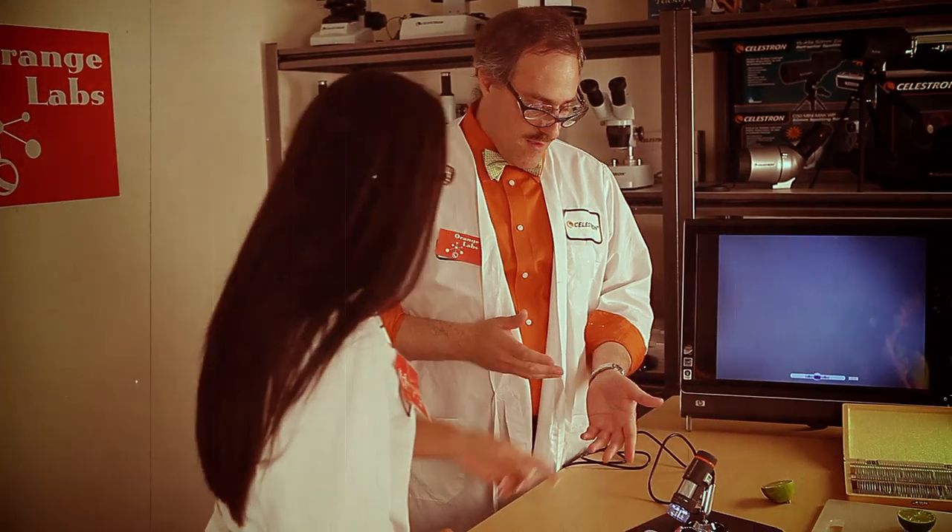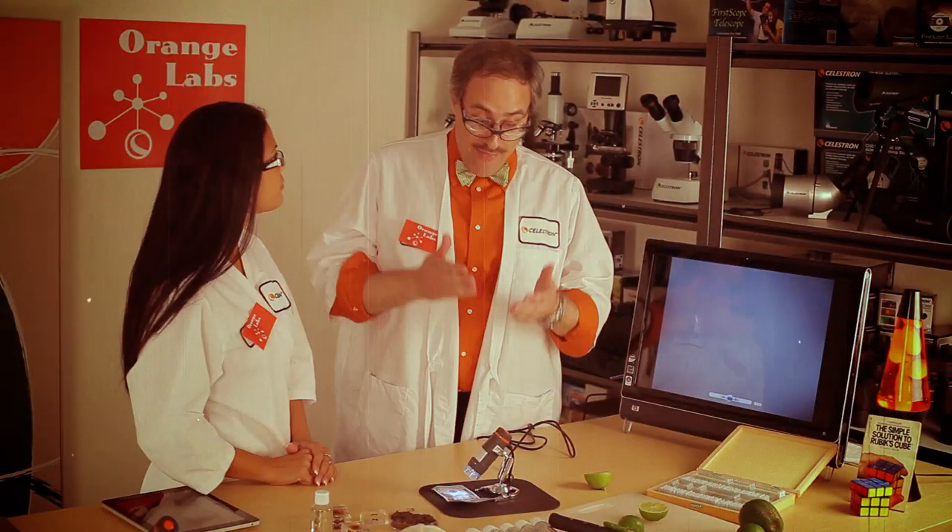So let's go through the features again: it's got 10, 40, and 150 magnification; a built-in LED to illuminate your samples; photo management software; it takes 1.3 megapixel pictures and video; and it plugs right into your computer using a USB port, which means it doesn't need batteries. I think this passes the Orange Lab test. For those of you watching at home, this would be a great holiday gift for any Jane scientist or Johnny engineer growing up in your household. So go out and get yours today.